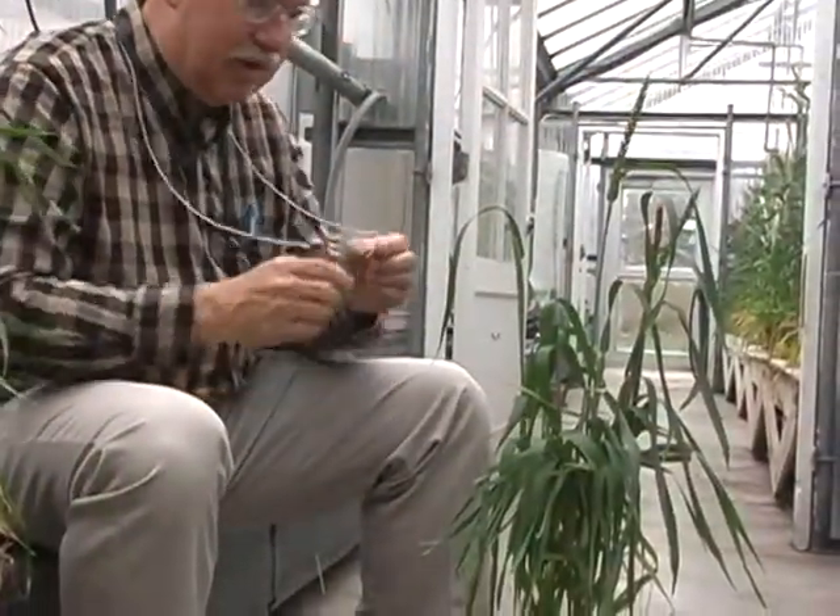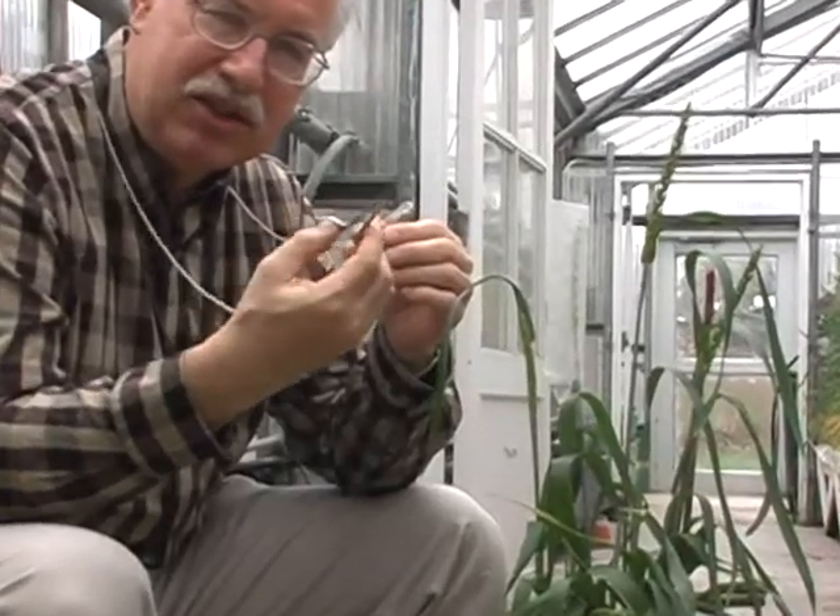The two things a breeder has to have are a very good set of tweezers. Everybody gets used to a particular set of tweezers. I've been here since 1986, so this is my 24th crossing season, and I've probably had this set of tweezers for at least 22 years.